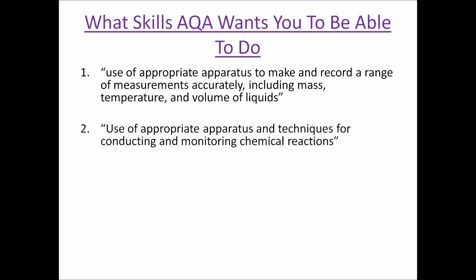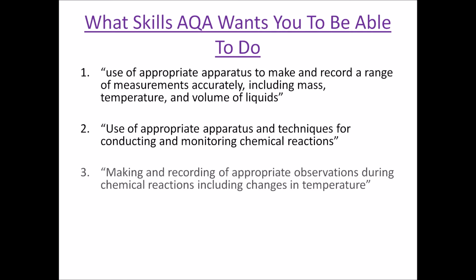They also want you to use appropriate apparatus and techniques for conducting and monitoring chemical reactions, which in this case essentially just means they want you to be able to use a thermometer to measure the temperature of the reaction, and they also want you to be able to use glassware safely and considerately. So, fairly easy.